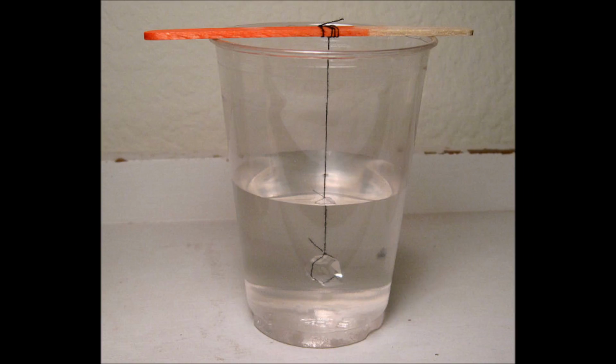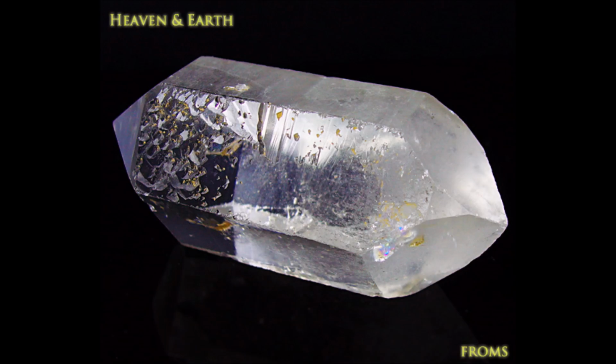If there is a seed crystal, upon evaporation, the alum within the solution will attach to the seed crystal when it solidifies instead of forming crystals on the bottom of the vial. This is because of the attractive forces between the seed crystal and the alum within the solution.